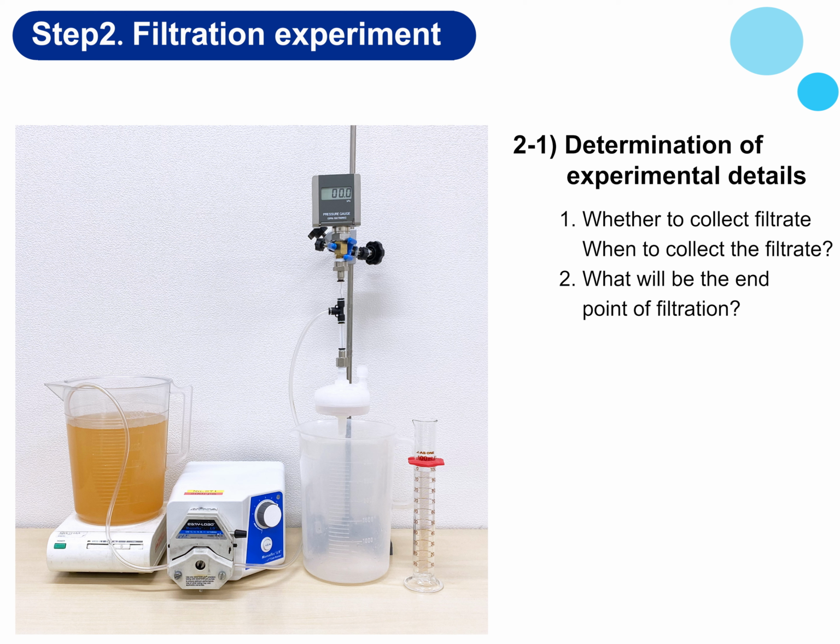Set the filter according to the purpose of the experiment. In general, the endpoint of filtration is determined by the amount of liquid to be passed through one type of filter or when a predetermined pressure is reached.